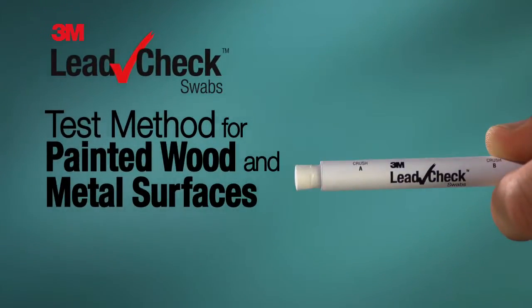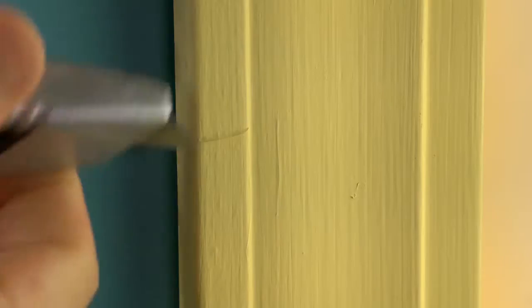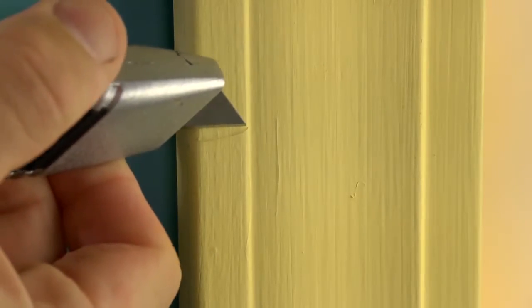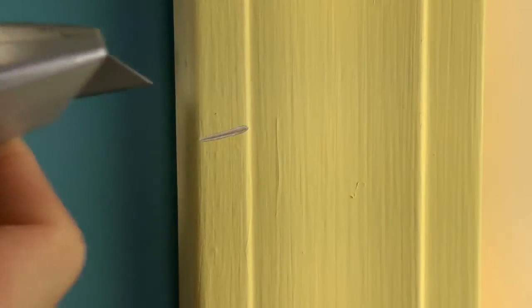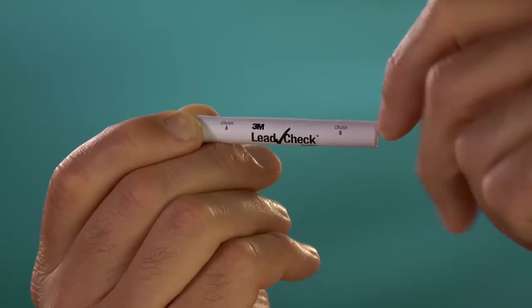This test method is for testing painted wood and metal surfaces for the presence of lead. For wood surfaces like moldings and window frames, use the clean utility knife to cut through the paint layers to the bare substrate. Now you may prepare to activate the 3M LeadCheck swab.